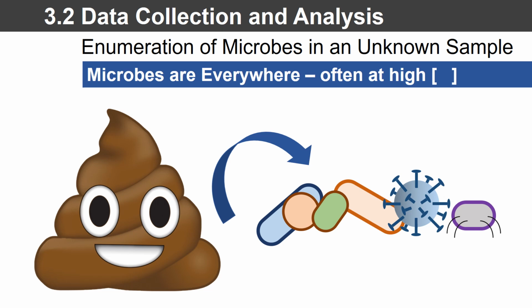That's just going to set the stage. It's not important that you're taking notes about this. It's just to give you the idea that they're present, that they exist in high amounts, and that it's often important to determine how much are in there. And we're going to get into that particular component during the in-class exercise for this week, when we take a look at how bacteria recovered from a mouse might be affected by one treatment or another treatment. And that's a really important thing when you think of human disease, for those of you who maybe down the line are going into some sort of biomedical related science or even an environmental related science.